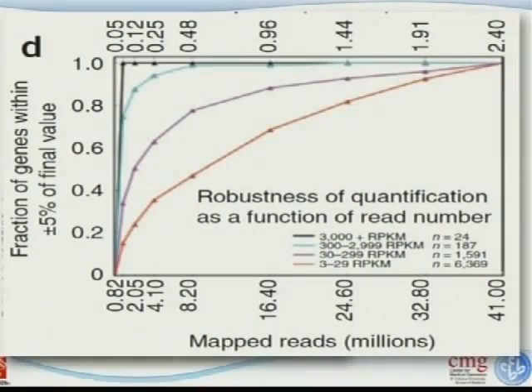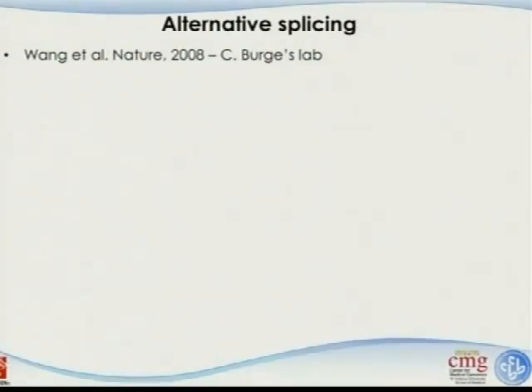And if we talk about 3 to 30 RPKM, this is the performance. So the point here is the deeper the sequencing is, the more accurate your result will be. But keep in mind, 3 RPKM is already a pretty big number. So based on this type of measurement, if you think deeper and play with real data, you can estimate how accurate your final result is.